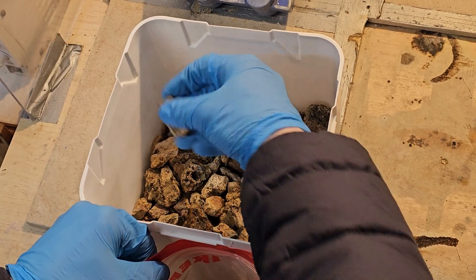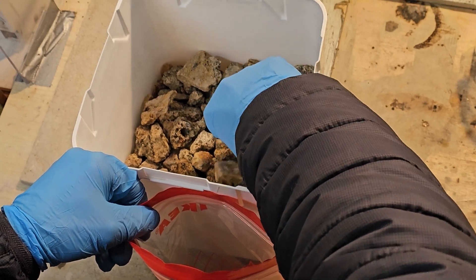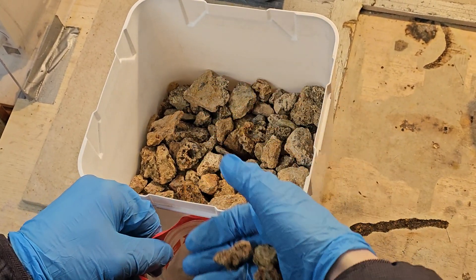We also decided to grab an average looking stone and perform an XRF analysis with it. We'll discuss the results later in the video.